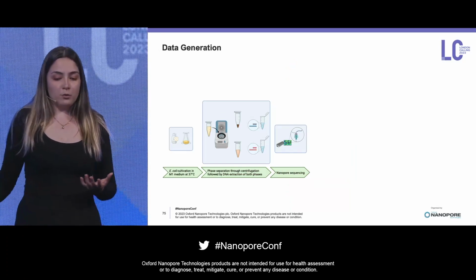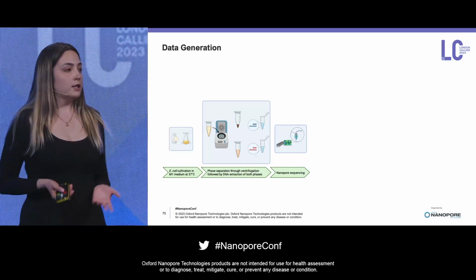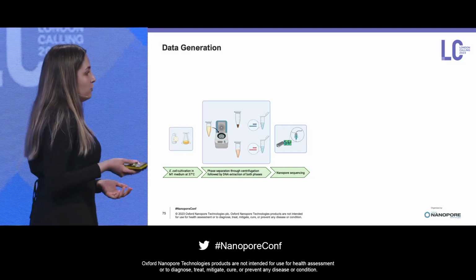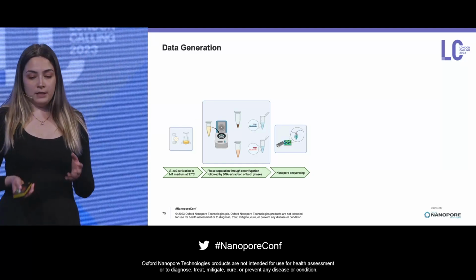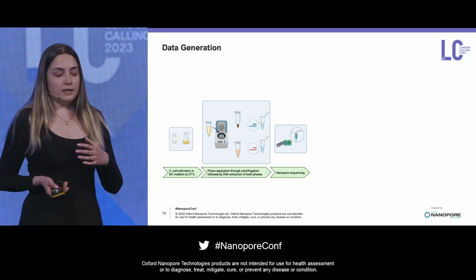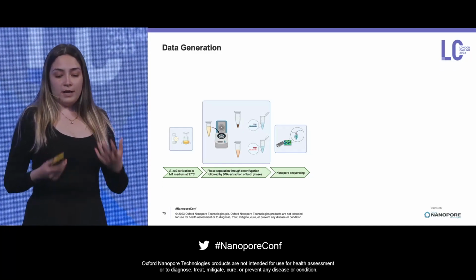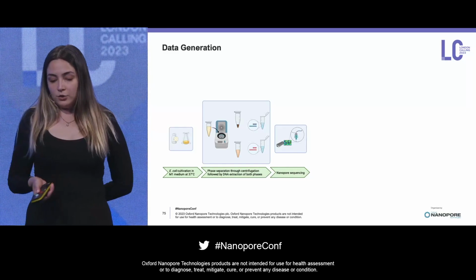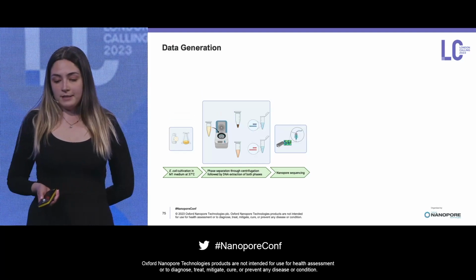And of course, to train a model, we first needed to generate the data, and we achieved this by culturing E. coli for 42 days and inducing cell death by not providing any nutrients starting from day 3. We separated DNA from living and dead microorganisms via centrifugation, where we find the dead, free-floating DNA in the supernatant and viable DNA in cells in the sediment. Later, we used nanopore sequencing to generate squiggles from these DNA fragments.